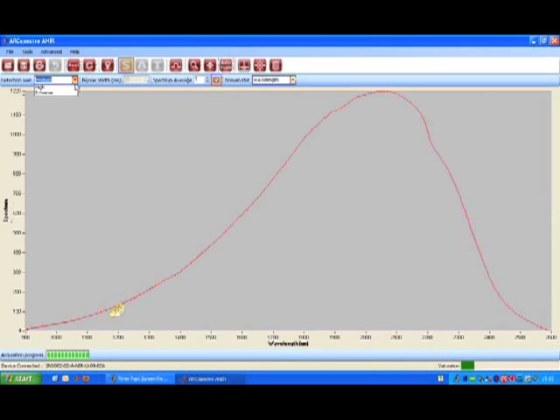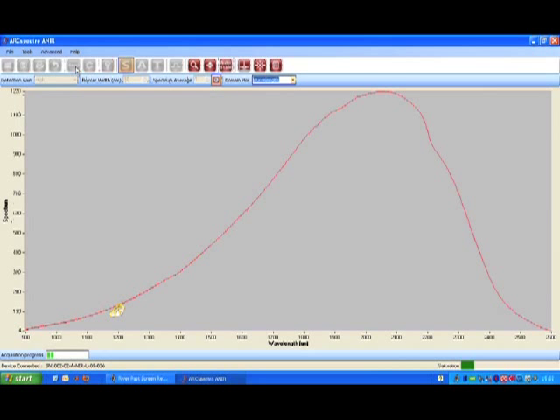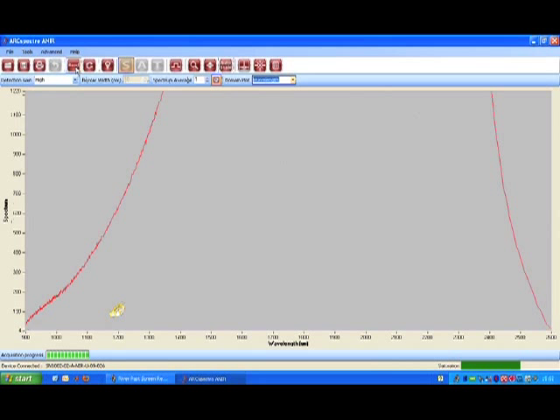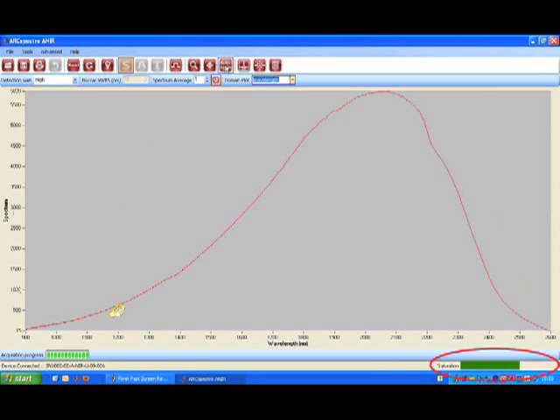Turn the gain to high level and take another measurement. As you can see on the saturation bar, the signal level on the detector is now satisfying.